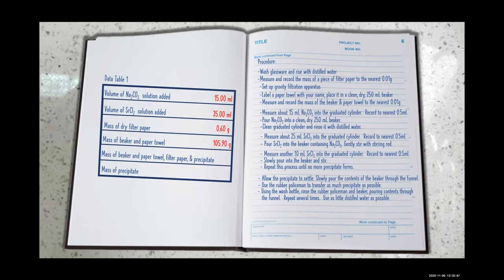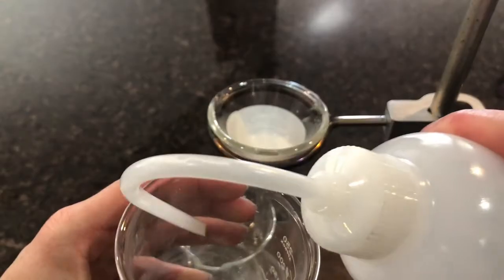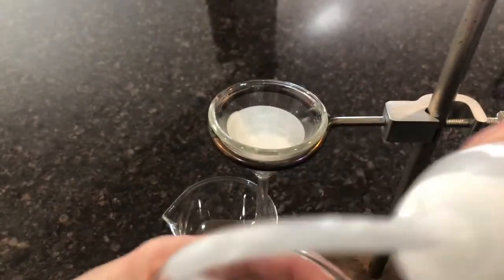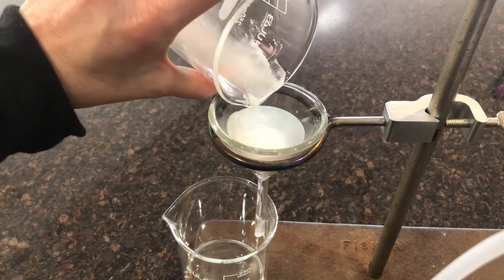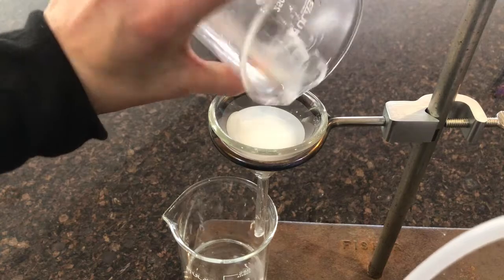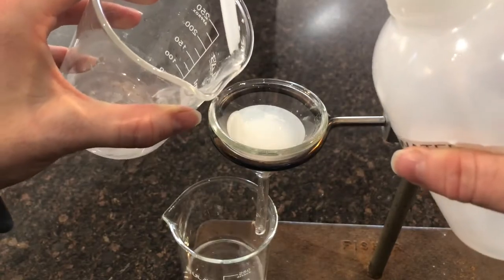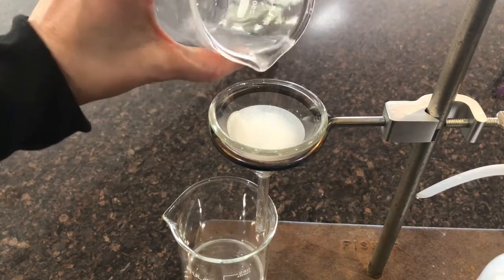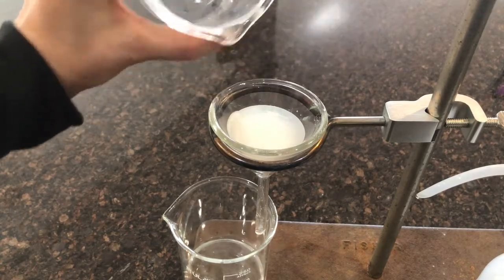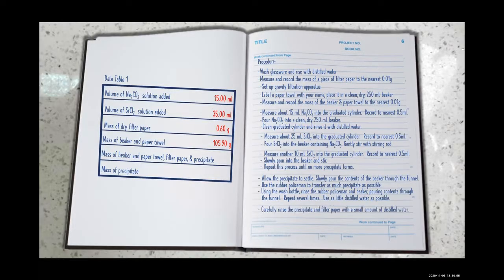Use as little distilled water as possible. Carefully rinse the precipitate and filter paper with a small amount of distilled water.